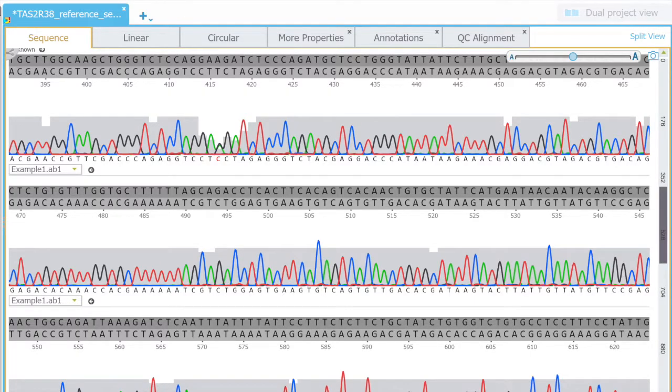This tutorial will show you how to use Genome Compiler to compare multiple DNA fragments. Remember that bitter taste ability is determined by a series of SNPs, single nucleotide polymorphisms.